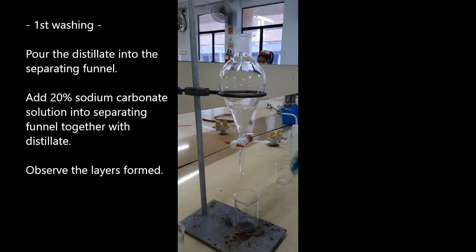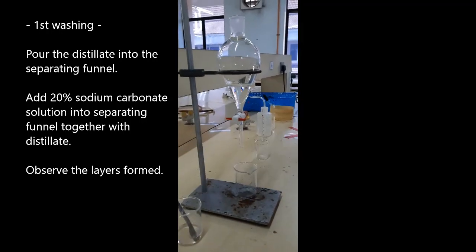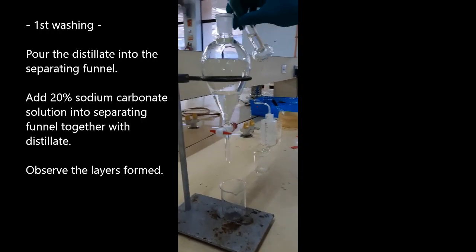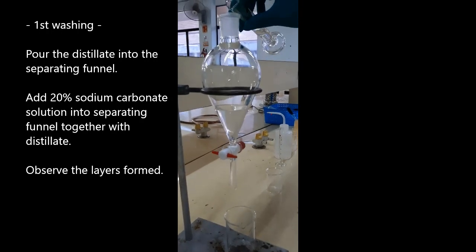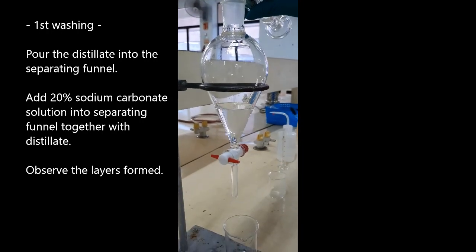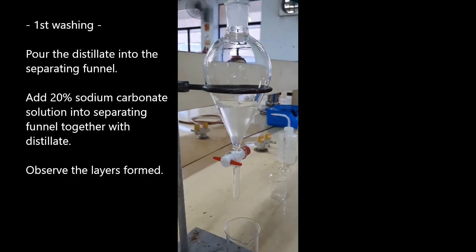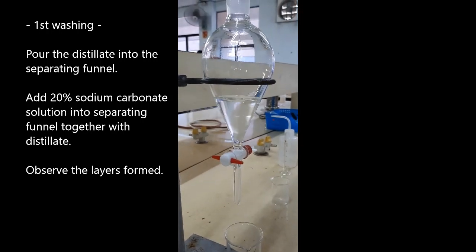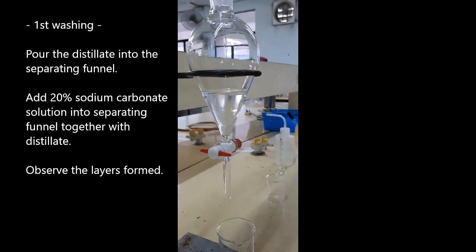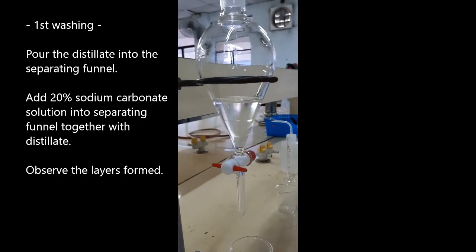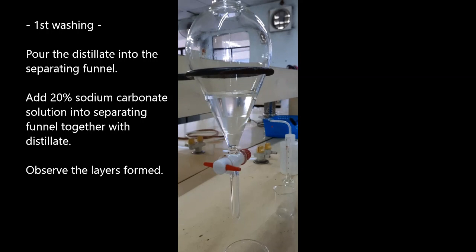For the first washing, carefully pour the distillate into the separating funnel. Add 20% sodium carbonate solution into the separating funnel after the liquid. Observe the liquid layers form.